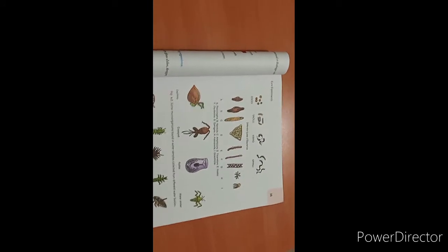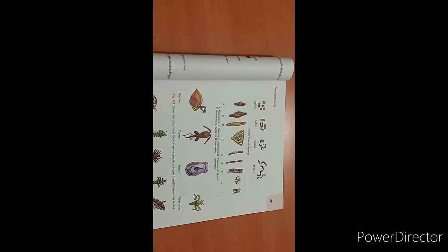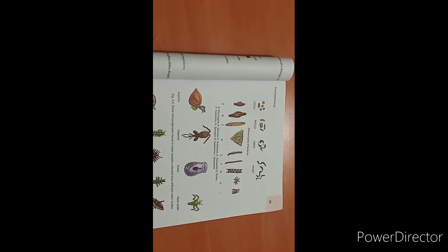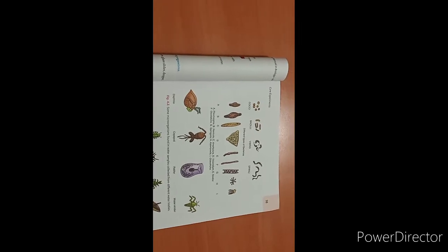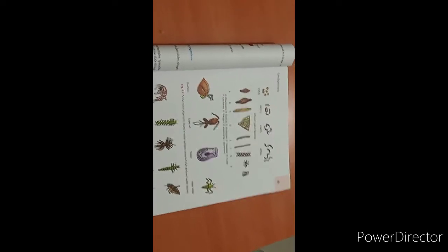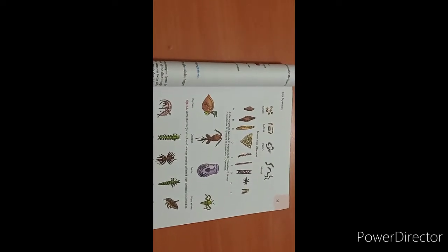So just now I have shown you one video in which you could see some moving organisms, which was done on some particular day. Because the slide was very good, I had kept it for this particular experiment. Now these are the different types of organisms that you can also observe in the pond water.